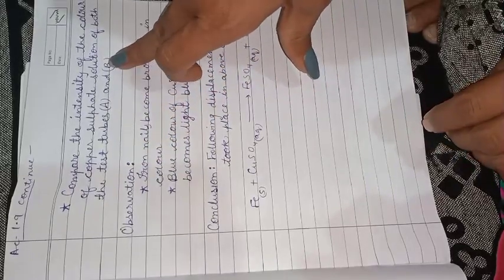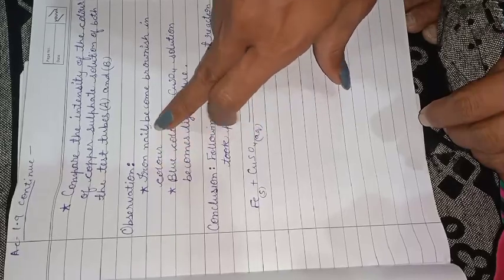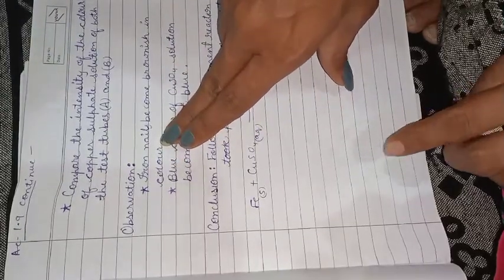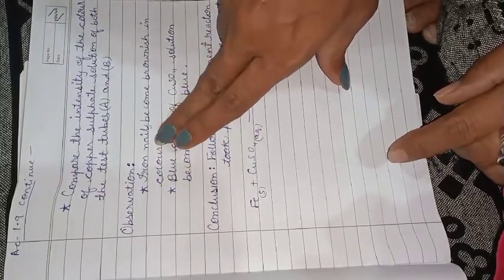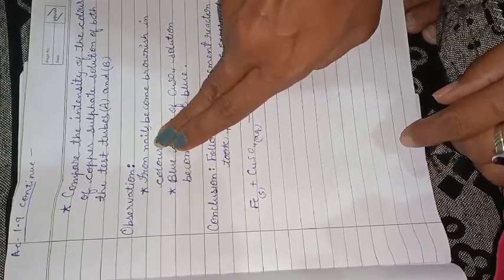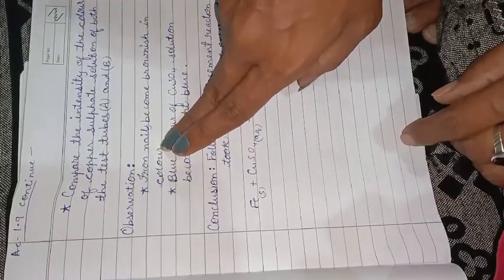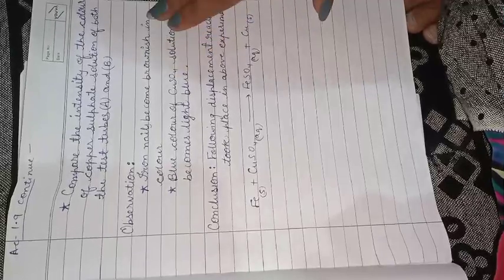Now, what is the observation? We will observe that the iron nails become brownish in color. क्या कलर हो गया? आयरन नेल जिसको अपने इमर्स करके रखा था कॉपर सल्फेट के सॉल्यूशन में ब्राउनिश कलर हो गया. ठीक है ना, तो आयरन नेल जो हमने साइड में रखी थी उससे हम इसको कंपेयर करेंगे तो हमारी जो आयरन नेल का पहले जो कलर था, जो प्योर आयरन का होता है वैसा था, वो कैसा हो गया है? हमने जो इमर्स की थी वो आयरन नेल्स हमारी ब्राउनिश हो गई है.